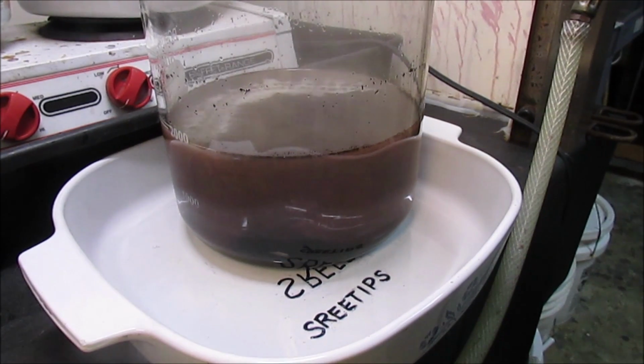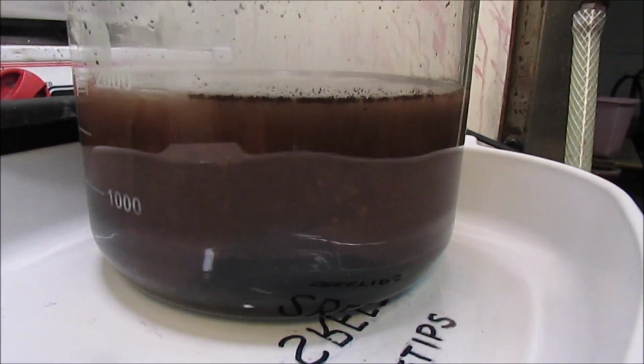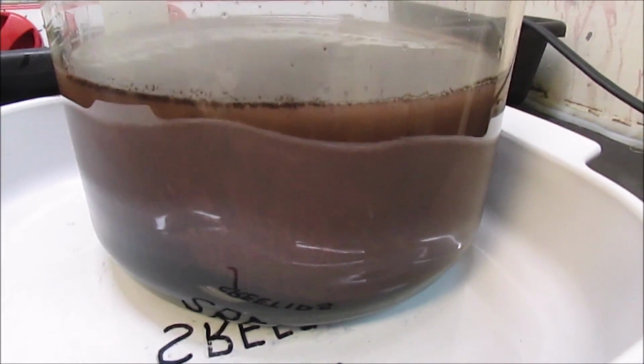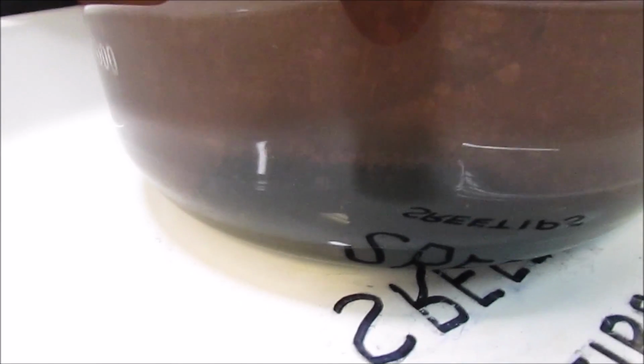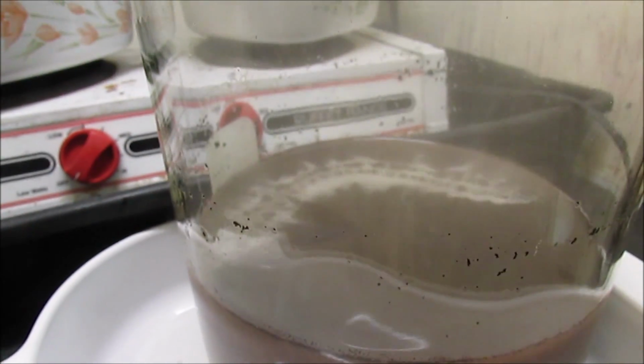Reaction's been going for about 45 minutes now, and I'm getting some pink colored material on the side of the beaker there, and the solution looks like it's turning pink. There's a ton of metal down there. It's kind of freaking me out, man. I didn't expect to see that much metal coming out of solution. That's still the second piece of zinc in there.